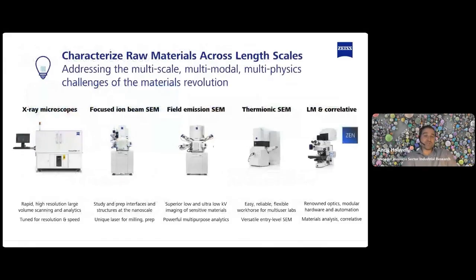So I would just like to sum up this introduction with, as Stephen said, we've got a uniquely broad portfolio of microscopy techniques. And what we're doing here is characterizing our raw materials all across the length scales from millimeter to nanometer, with multi-scale, multimodal, multi-physics techniques to power the materials revolution.